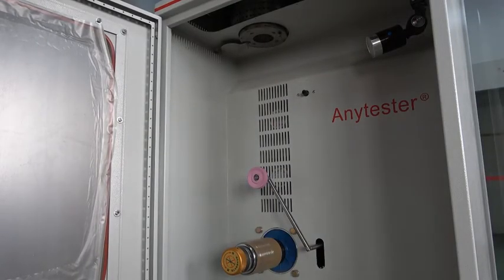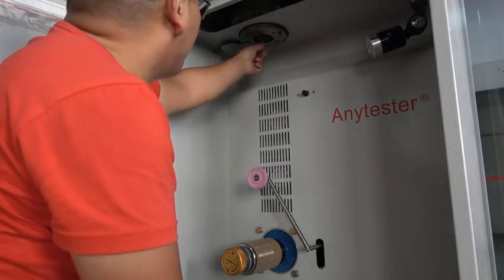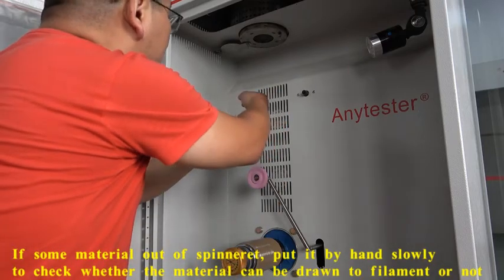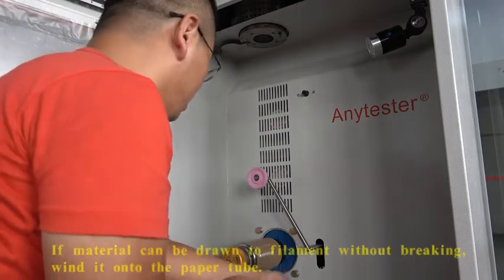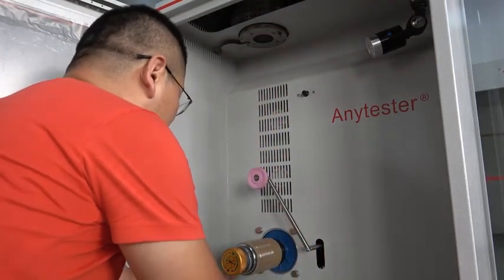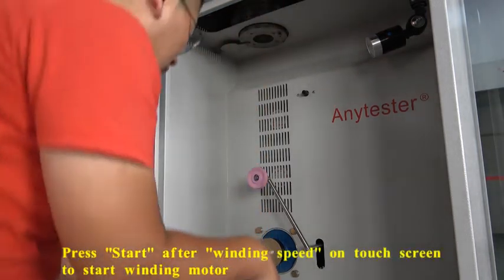When applying pressure into the barrel, check if any material comes out here. If yes, pull the material down and wind it onto the paper tube. Start the winding mode on the touchscreen.